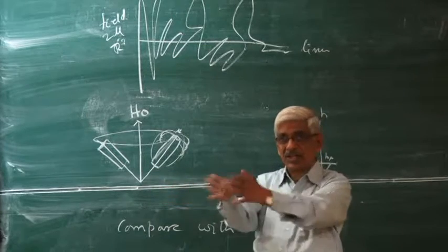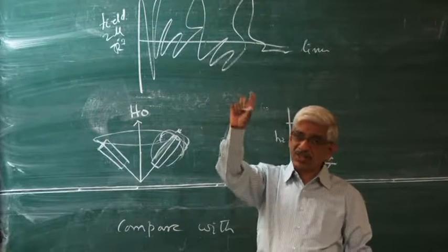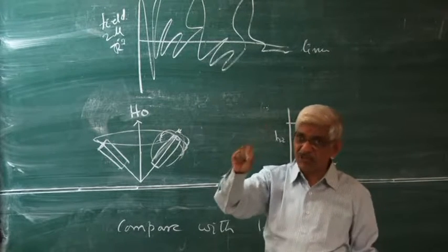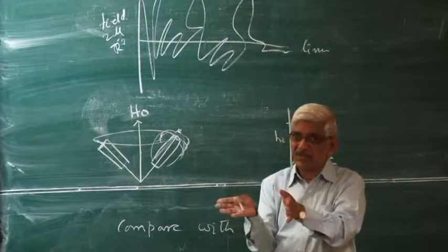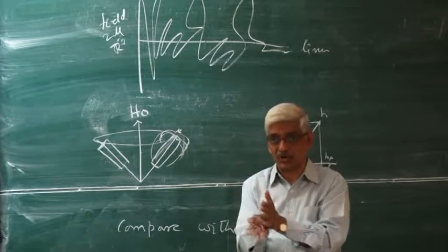So this will keep changing with respect to the z-axis. Because of the fluctuation in the z-axis, the field changes there. Therefore, the frequencies will change. That means the precessional frequencies of the spins will change. And when that happens, there is a decay of the transverse magnetization. The phase coherence is lost.